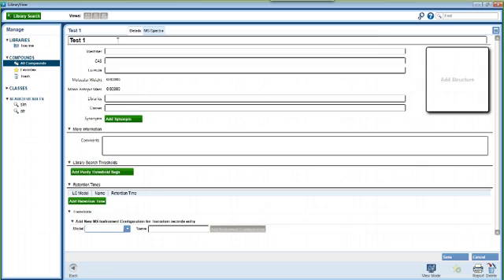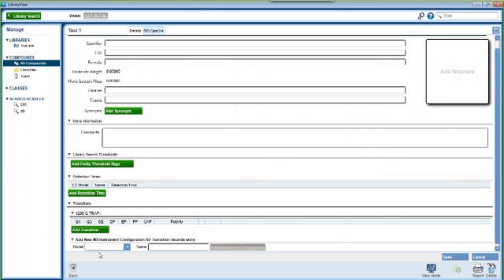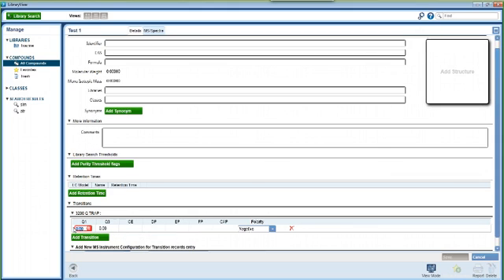This will open a new compound window. Here you will see a variety of information fields. We will add compound information including name, chemical formula, and CAS number if known. We will also add MRM transition information along with spectra. You can add compounds with as little as name only, but of course the more information you have the more useful your database. Once you have entered all the desired information, you can save the compound.